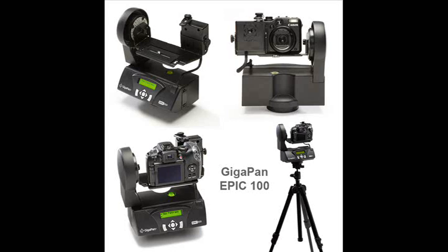The system was developed through a collaboration between Carnegie Mellon University and NASA's Ames Research Center for use on the Mars rovers, but is now available to the public. The hardware, shown here, is a robot that can accommodate various digital cameras and attaches to standard threads used on tripods and other photography accessories.